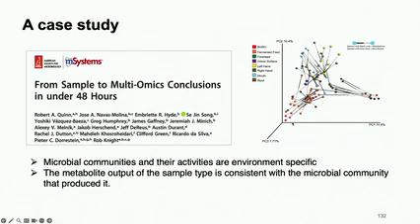And why we chose this is because Rob Knight, who was a pioneer in microbiome studies and also in microbiome-metabolomics integration, and what they try to do is really combine them to have a faster diagnosis, maybe precision medicine, and so try to have multi-omics.